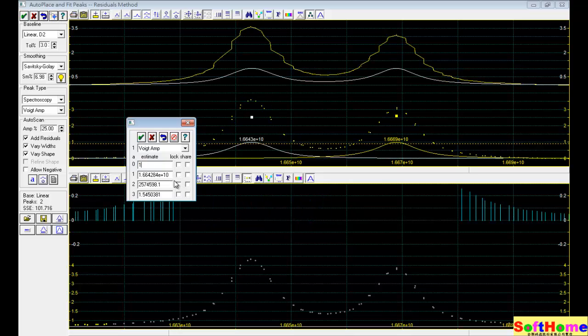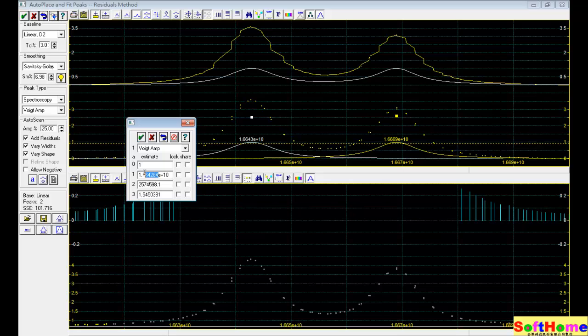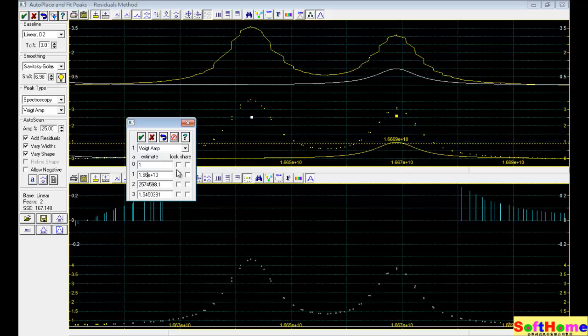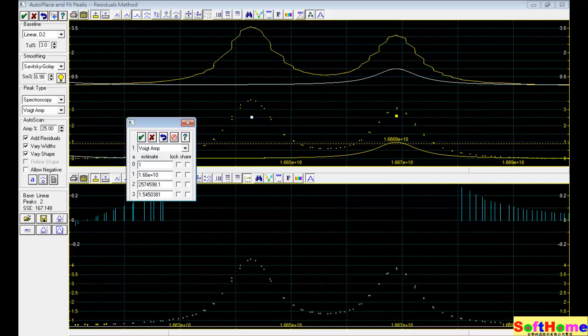You change 1 into 1. So you can change each peak, each parameter. You can change the x position. But because it's very sensitive, so you must very carefully to adjust the parameter.